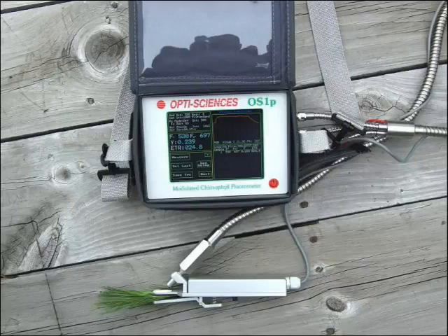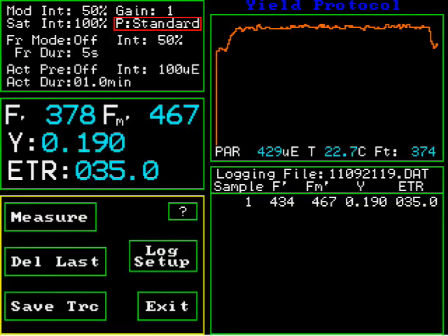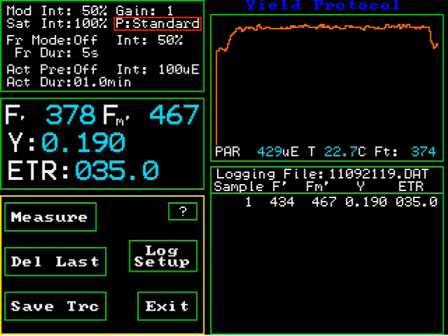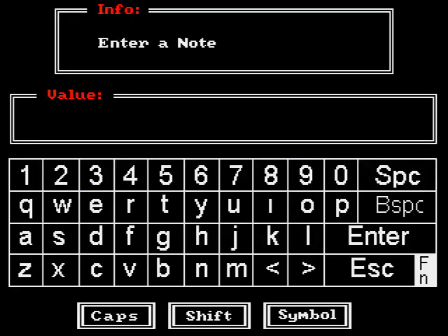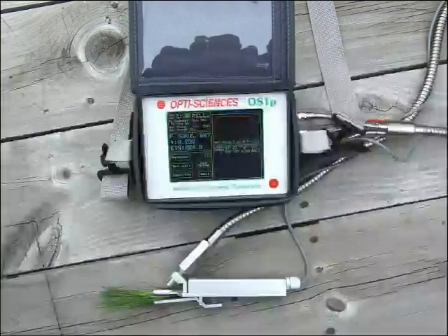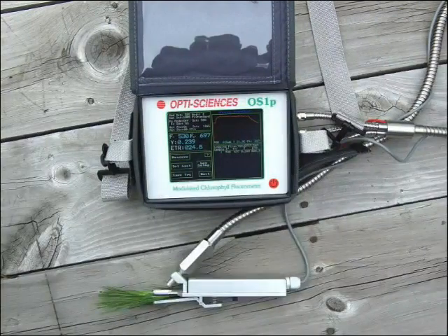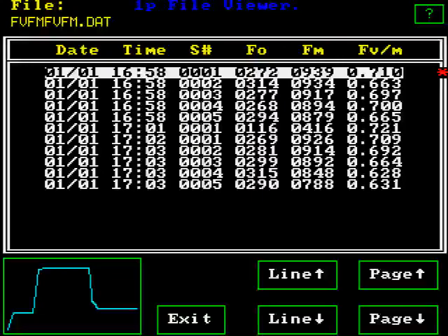The new instrument now offers a menu-driven color graphic touchscreen that allows several new advantages, including graphic display of measuring traces, display of current and previous results, the ability to add comments to measurements, and improved ease of use that allows easy instrument adjustment and access to data.